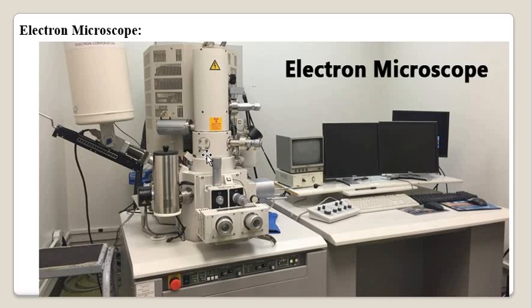Then a water cooling system. See, a water cooling system is also required. The electron microscope requires a cooling system to prevent overheating of various parts by the pumps and coils, because the pumps and coils require a 220 volt electric current, and that can cause heating of various parts and coils of this electron microscope. And if it gets overheated, then it can destroy the instrument. So as to avoid this, a cooling system is there, and the cooling is done with the help of water.